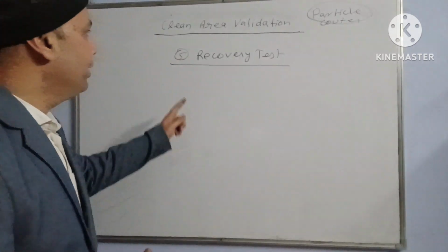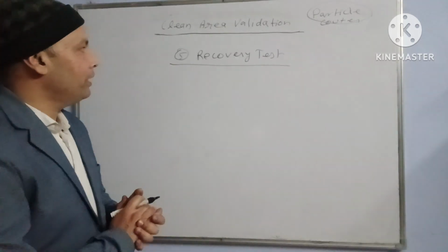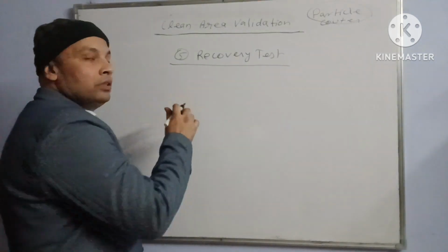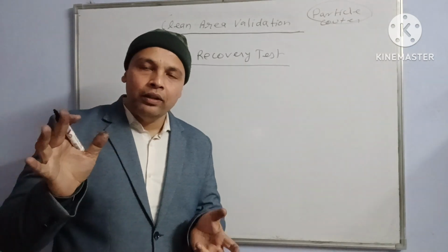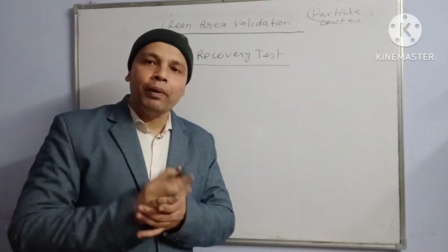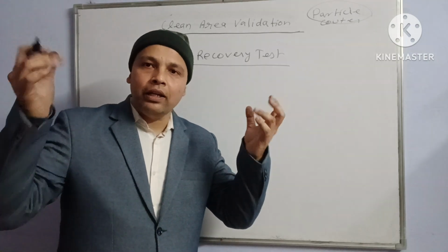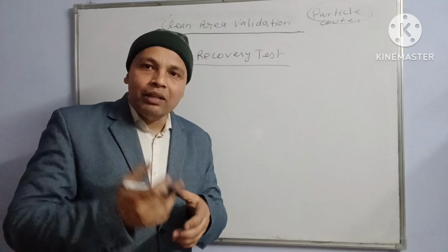The next test is the recovery test of the area. How can you perform that particular recovery test? Suppose due to any circumstance electricity has gone, HU is shut down, then the concentration of particles increases in the area. Then how will your area recover, or what is the limit for that?